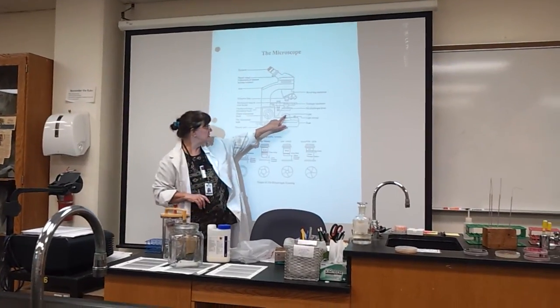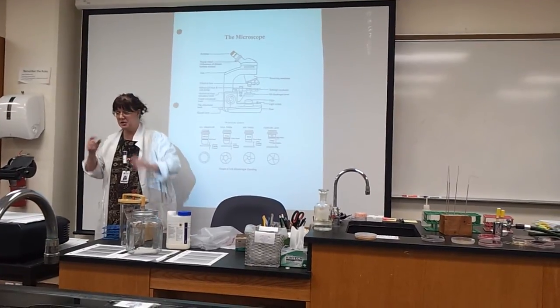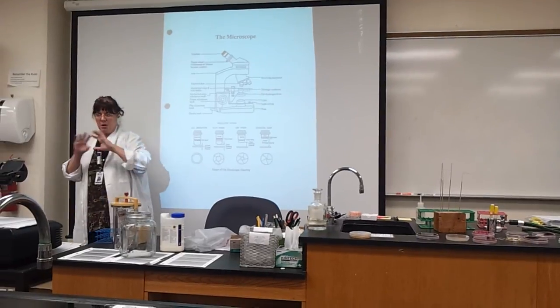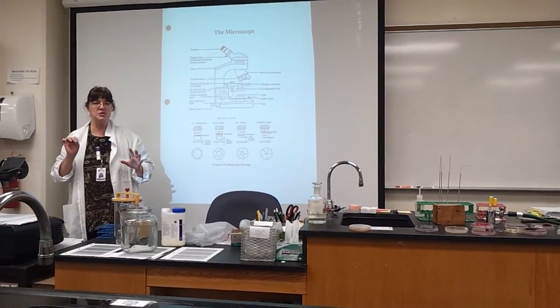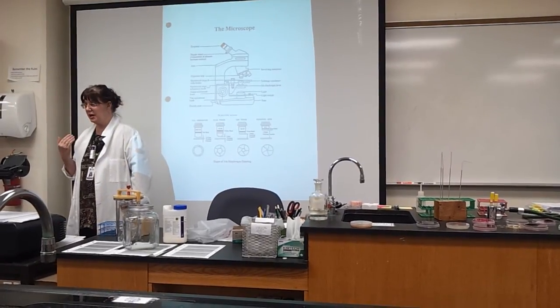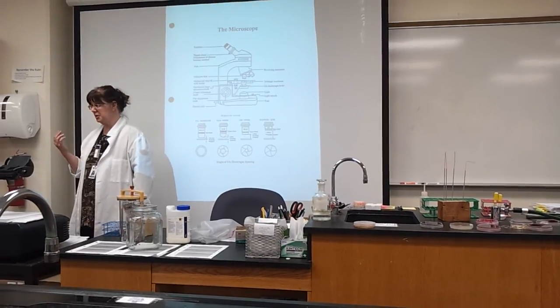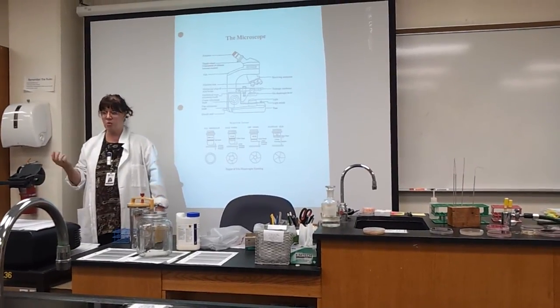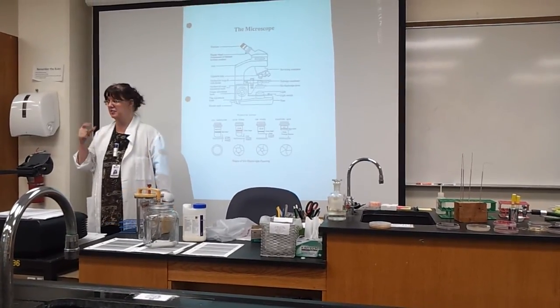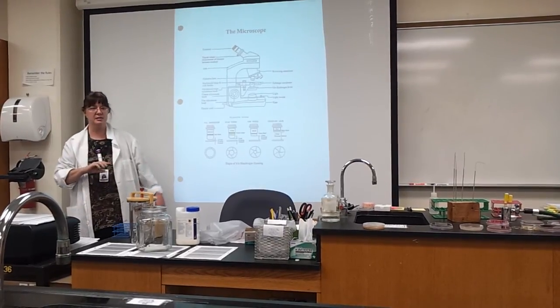First you have the white inner knob, which is your fine focus. Outside of it is your coarse adjustment. Nobody does anything but maybe some fine focus. If not, call me over. If you move that slide, I may not be able to find it in time for the midterm. Okay? I spend 4 hours setting this up. I hunt for the best place on the slide for you. Don't move it, because you're hurting everybody.